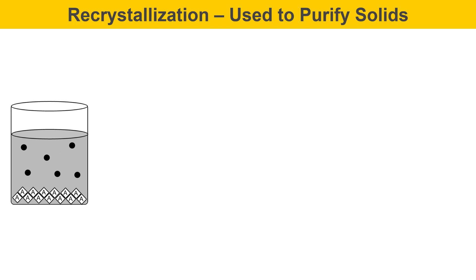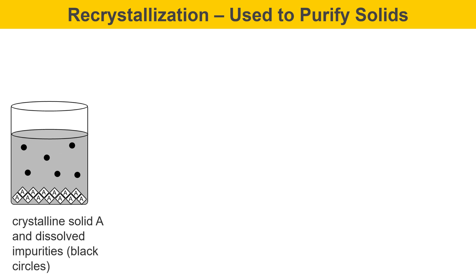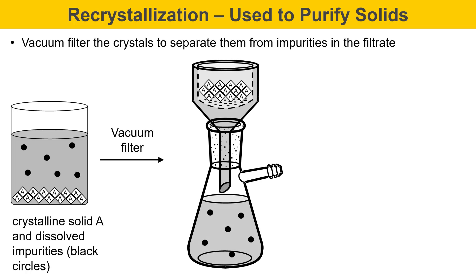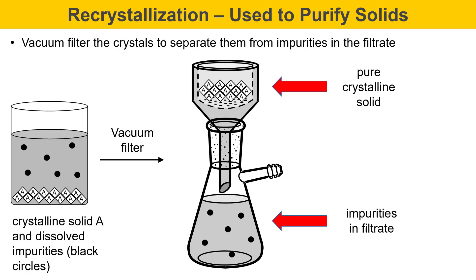So at this point, we have crystalline solid A and dissolved impurities in solution. Now I'm going to vacuum filter these crystals to separate them from the impurities in the filtrate. Upon vacuum filtering, the pure crystalline product ends up in the filter, and the impurities end up in the filtrate. This is how impurities are separated — they're filtered away.